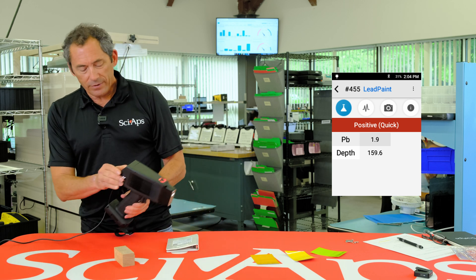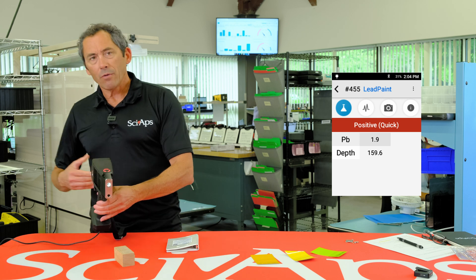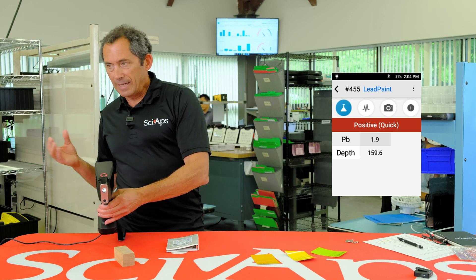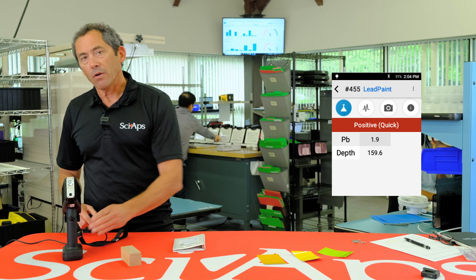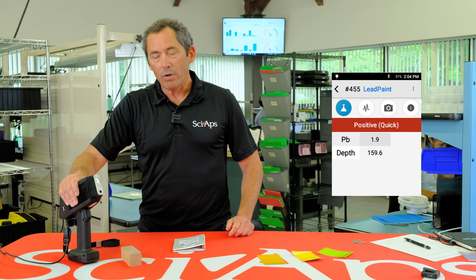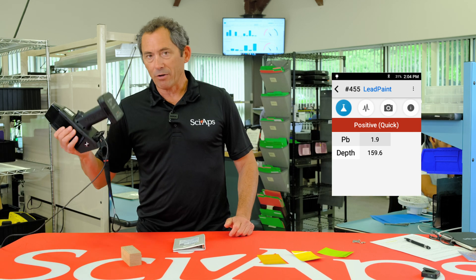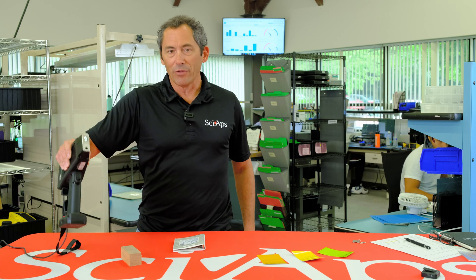There's a feature on the device called the depth factor, which shows that the deeper the lead is buried under non-lead paint, the larger that number. So this device has no problem detecting buried lead. We've eliminated the isotope and we've got a great PCS. Don't believe that nonsense when you hear it out there.